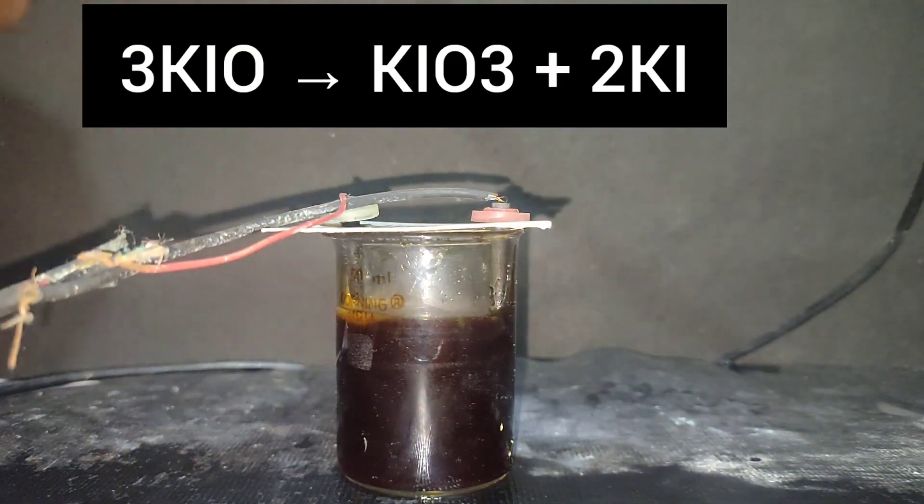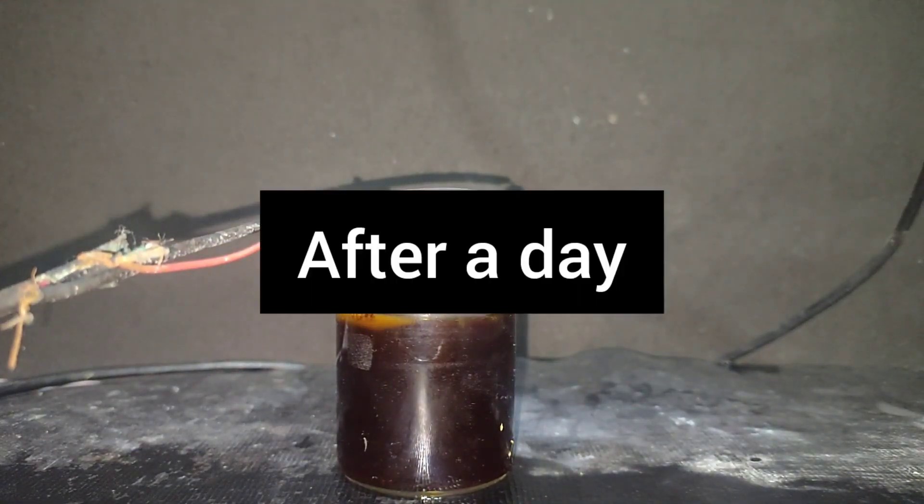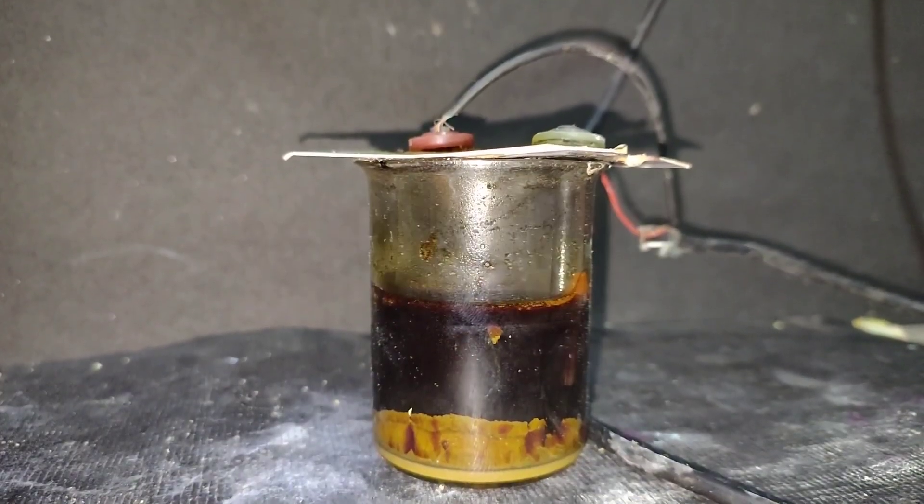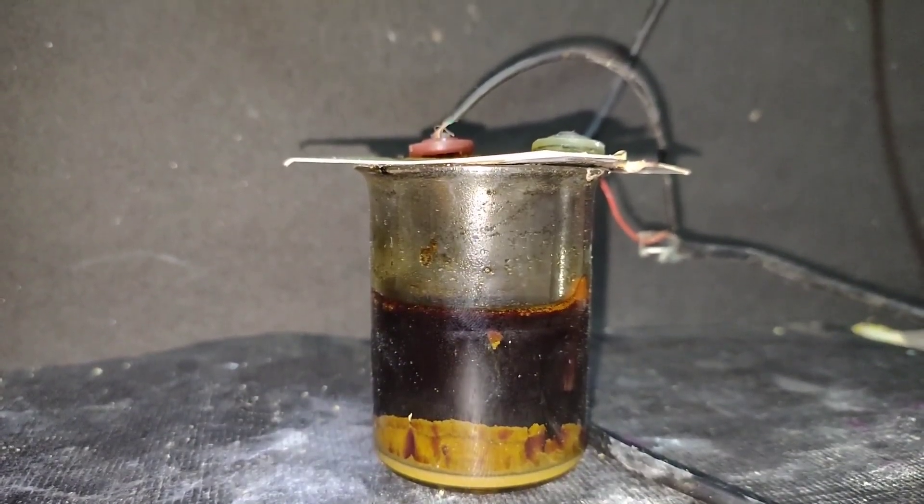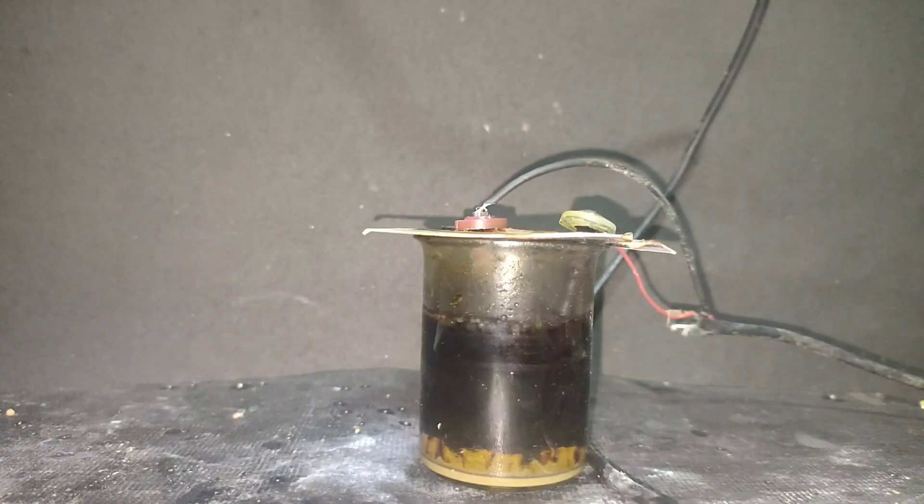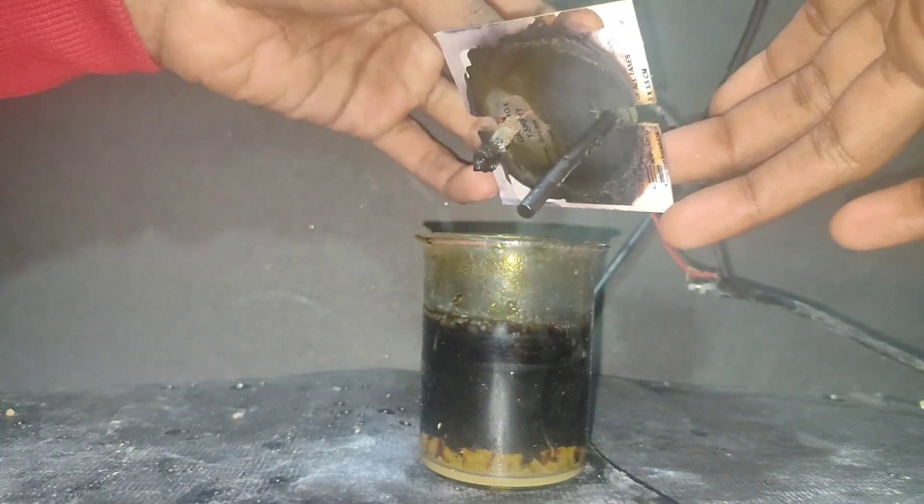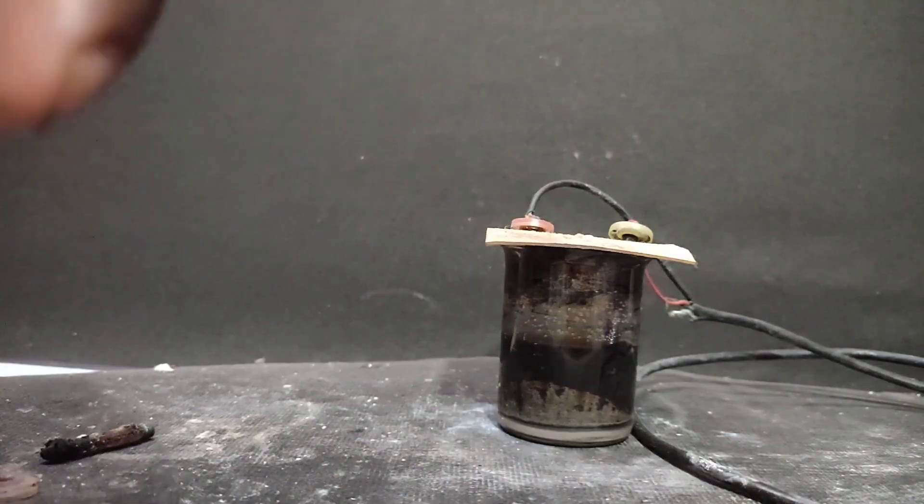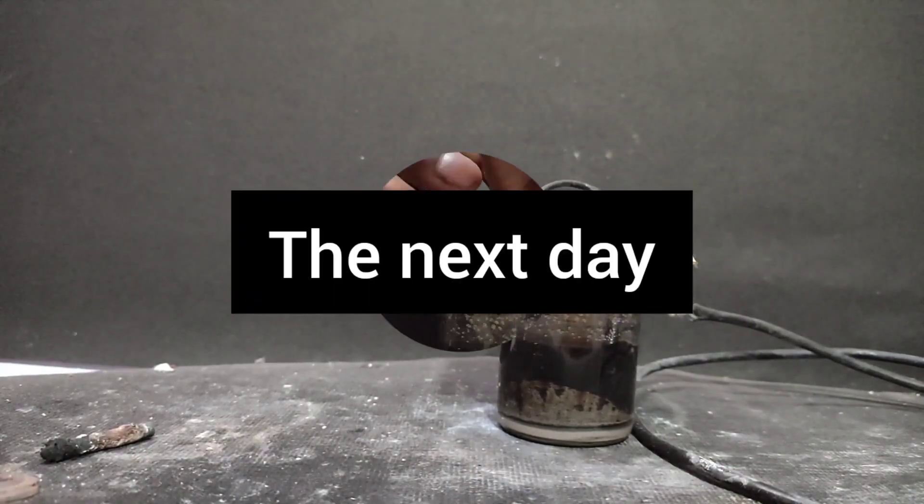The potassium iodate formed settles at the bottom due to low solubility. After a day, some crystals were seen at the bottom of the beaker, but when I checked the electrodes, the anode had disintegrated completely.